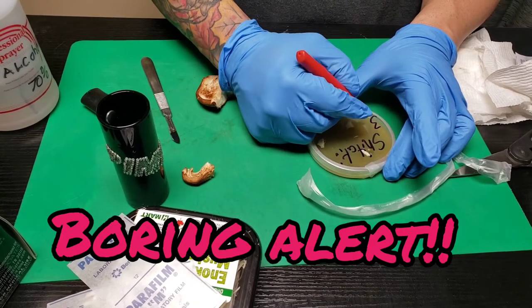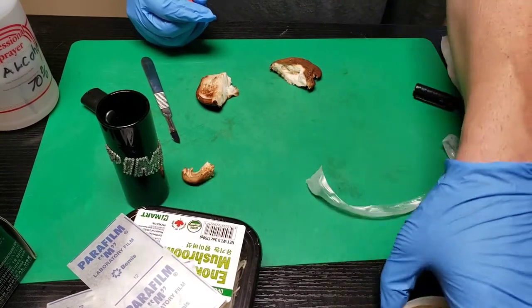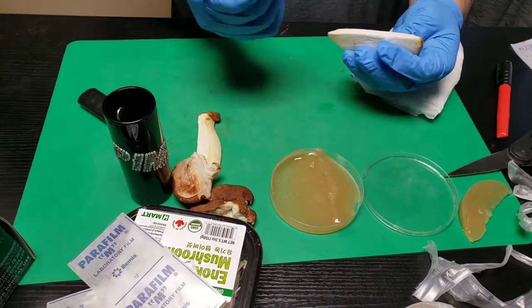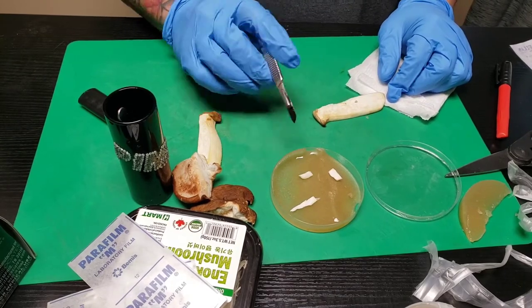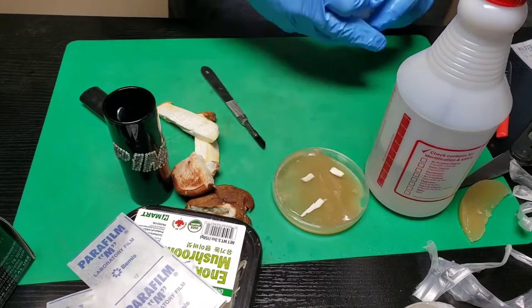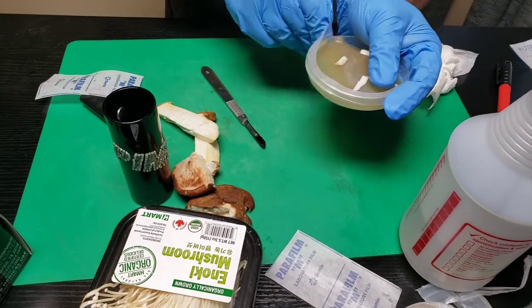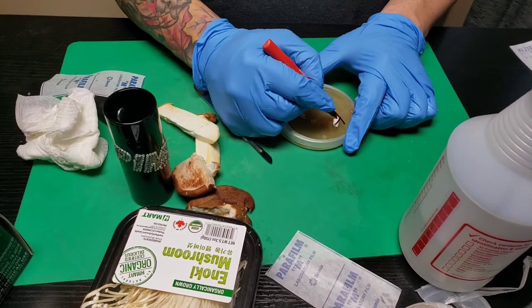As long as I can get a nice clean stripe in the middle, I'll pull off my parafilm. Once again, I'm going to cut the mushroom right down the center. I understand there are a thousand different ways to do this — this is just the way I do it. I've got a nice clean stripe in the middle, so I'm going to run the blade down, get a couple slices, nice and neat, close it up, and seal it with parafilm. This is going to be king oyster — 3/16/2020.